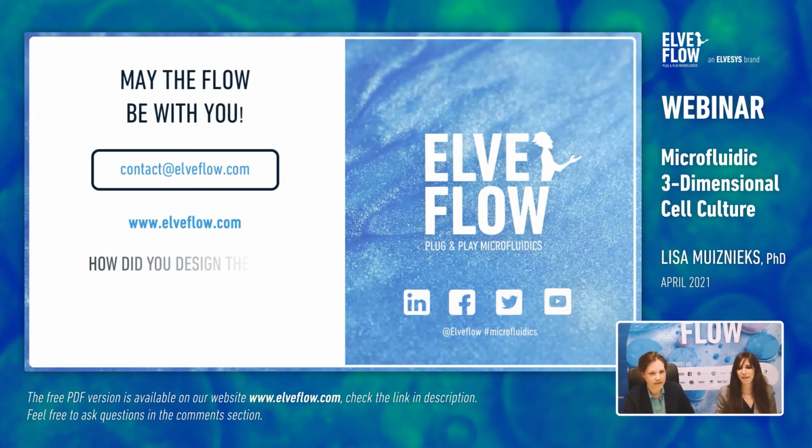Another question: how did you design the chip? So yeah, you can do different things. There's different strategies. You can design your own chip and fabricate it yourself if you have microfabrication facilities where you are. You can, for example, pouring with PDMS, or you can buy commercial chips if you prefer that already have the design already, so you don't have to worry about designing anything specific, and you can use something that's around. So it depends on your application. I think there are some chips around with 3 side-by-side channels separated by pillars. So you can already use things that are off the shelf. Yeah.